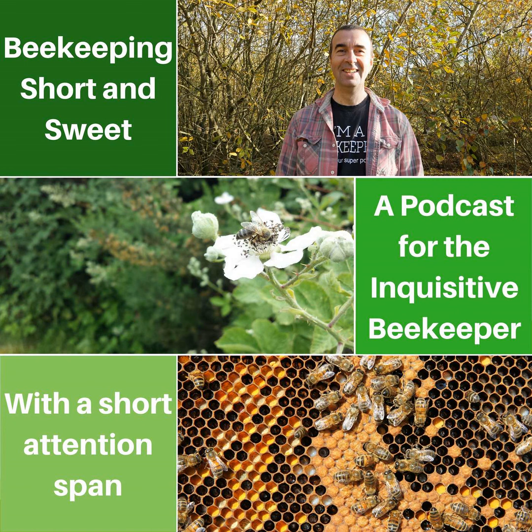Okay. You would then need, of course, some microscope slides and some cover slips. Right. Because you have to put a very thin sliver of glass on top of your specimen, and that's called a cover slip for obvious reasons. Right. And it would be a good idea to have a few stains and a few chemicals, and we've gathered those together into a kit which we call the pollen kit. Fantastic. And people can use the pollen kit for looking at any parts of a bee, really.